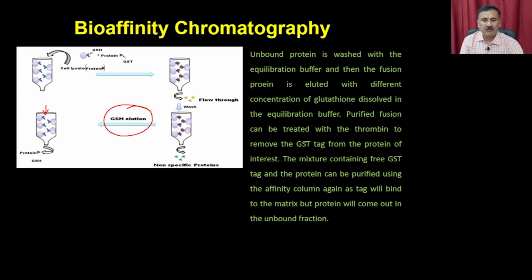After this step, you have the option to remove the tag, which you can do with the help of different types of proteases.